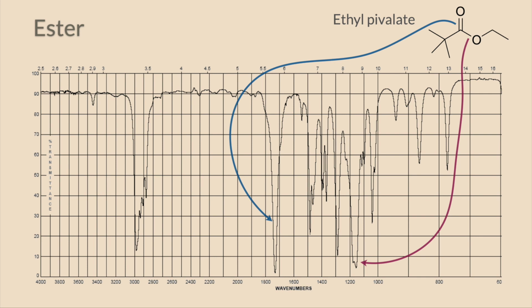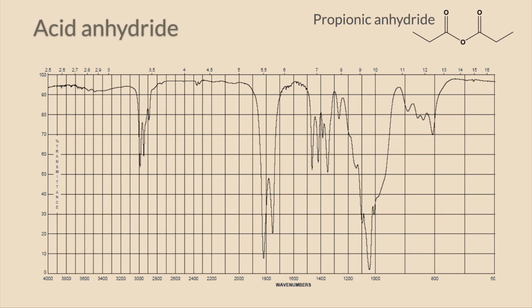But again, this is the fingerprint region, so sometimes it's possible to identify, and sometimes it is not.